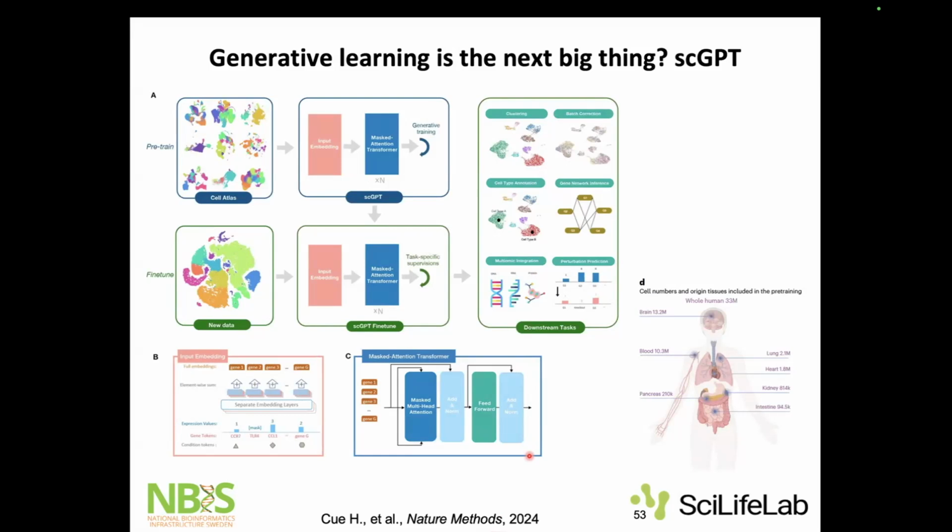Nikolai talked about this in the integration lecture, because this is not only doing annotation, it does a whole bunch of analysis. You can do almost all the downstream analysis using those. It depends on the integration that it does, and then when you get the output from it, you use the latent space for your downstream analysis.